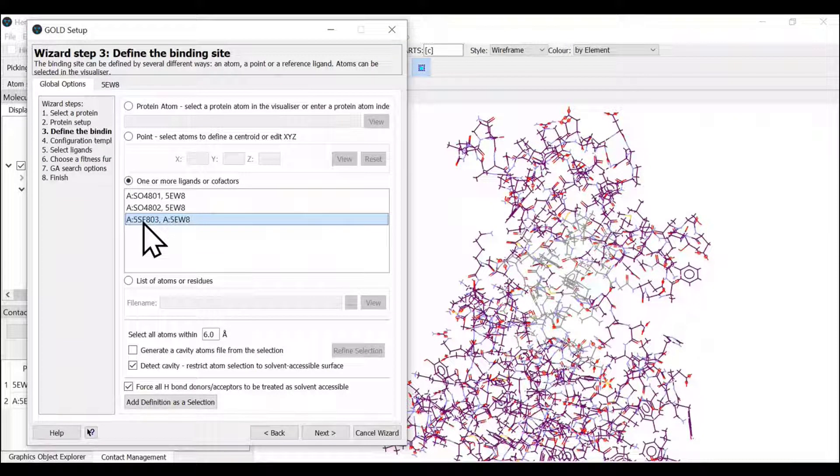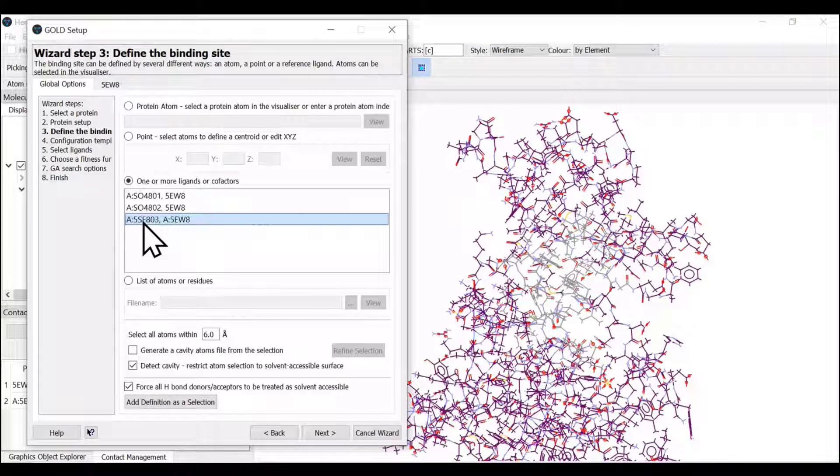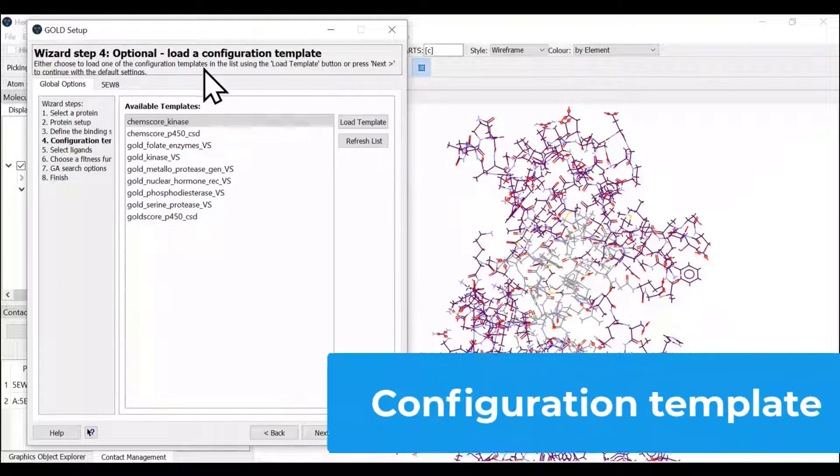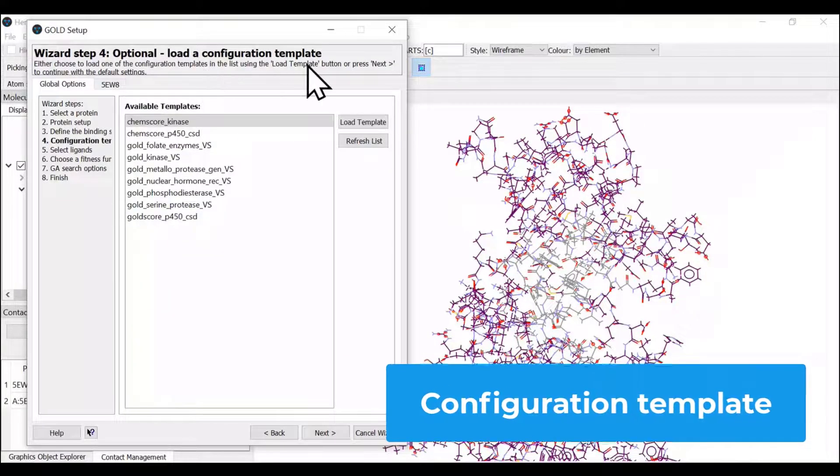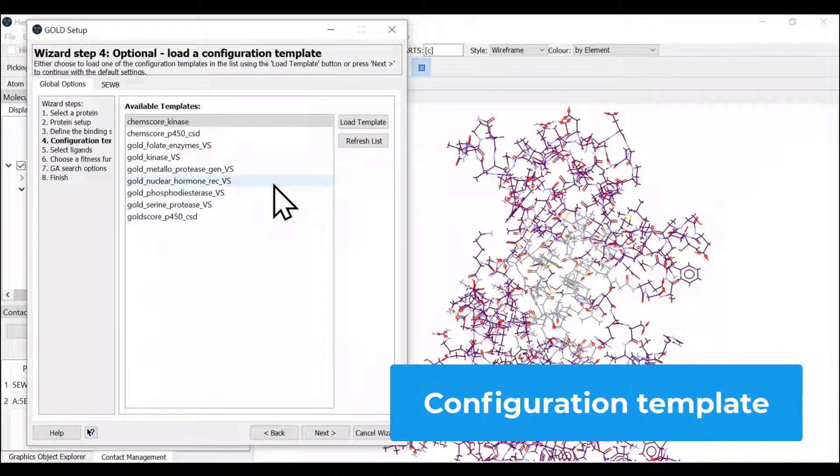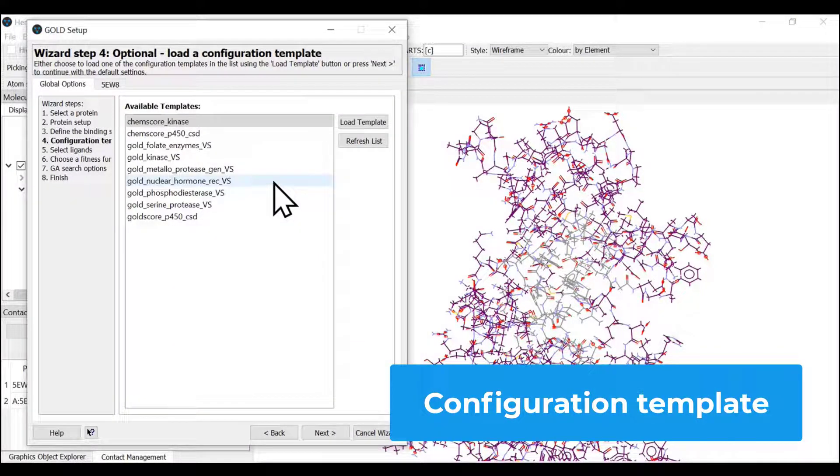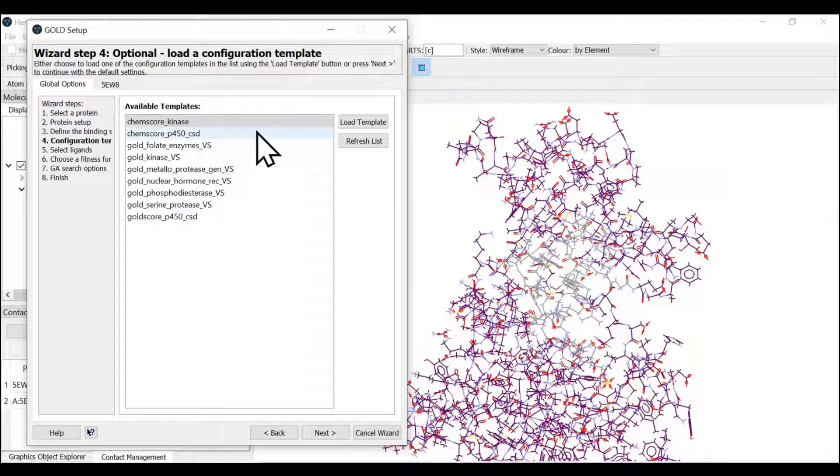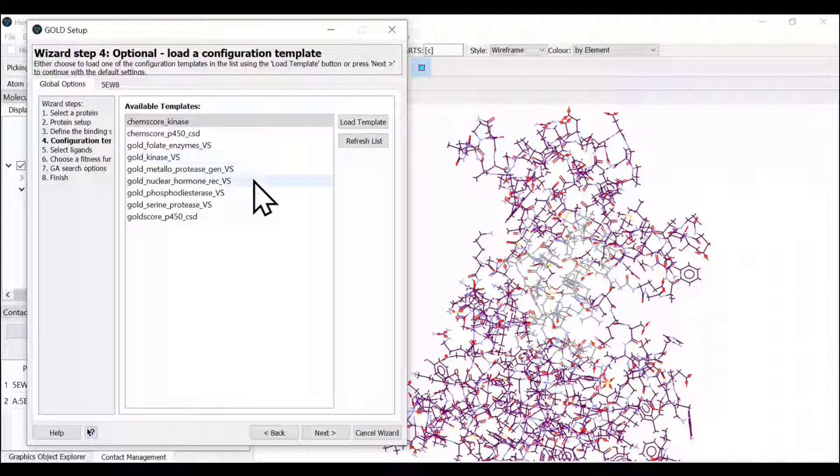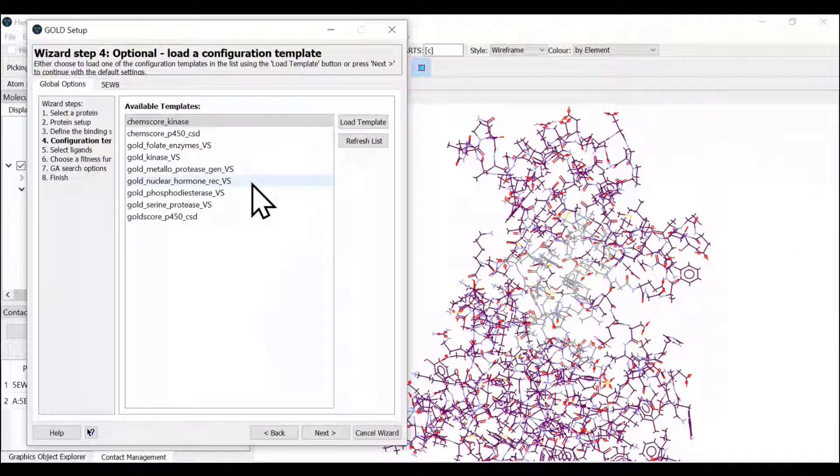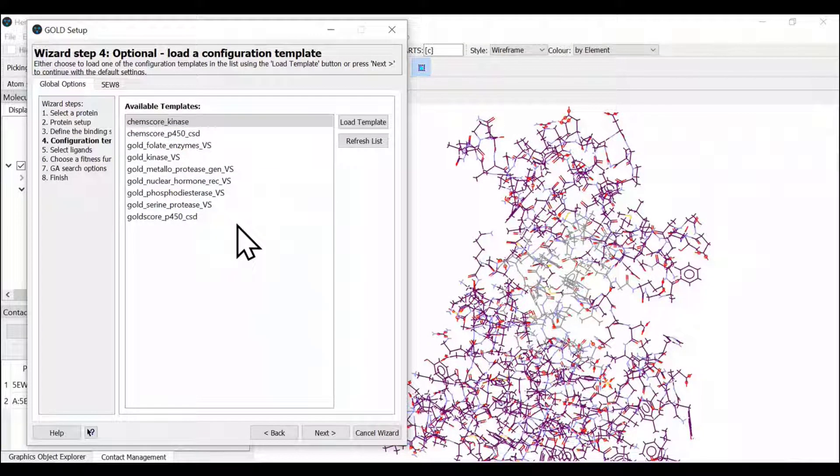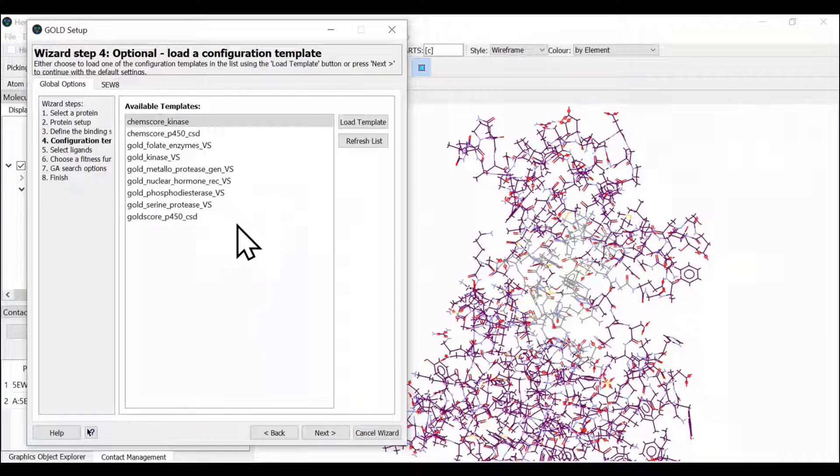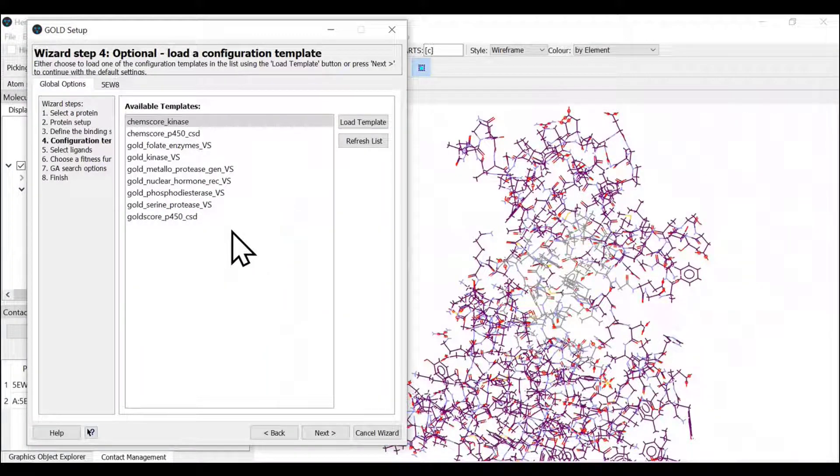Now next step is to see any configuration template we wish to use. GOLD provides several configuration templates that can be used for virtual screening. We are not going with virtual screening today. We are going to look into one ligand molecule, so we can skip this step.